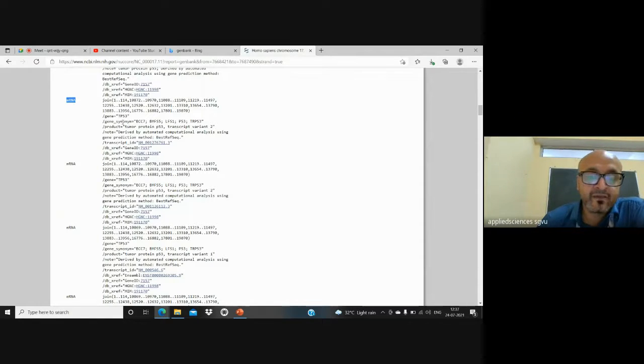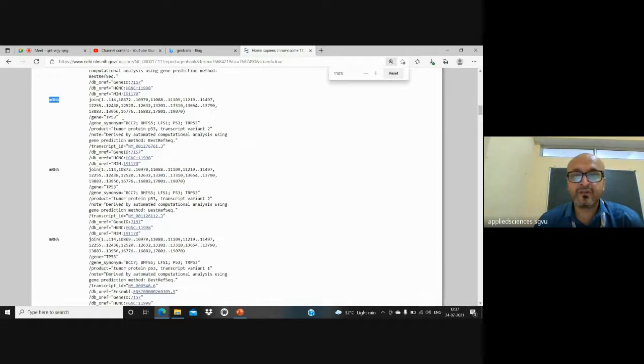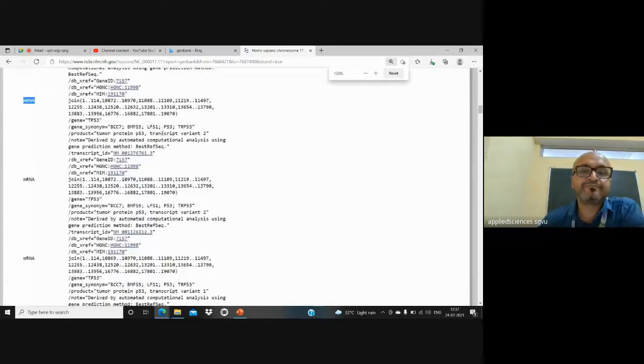So starting, please focus on this particular part. Let me zoom this for you if it's possible. Yeah. See, 1, 2, 3, 4, 5, 6, 7, 8, 9, 10, 11. So we have 1, 2, 3, 4, 5, 6, 7, 8, 9, 10, 11. What are these regions? These regions are the regions which are joining together to form an mRNA.